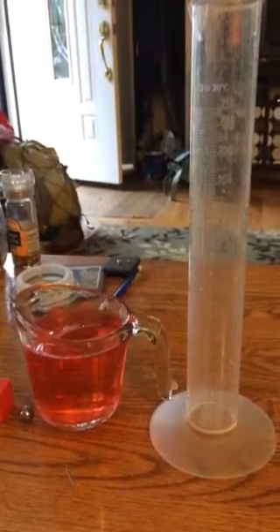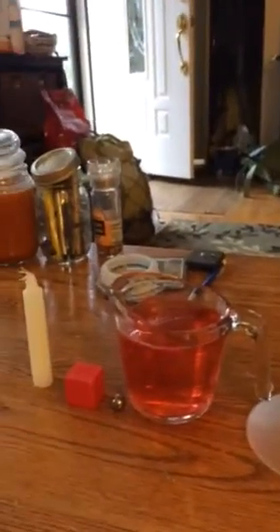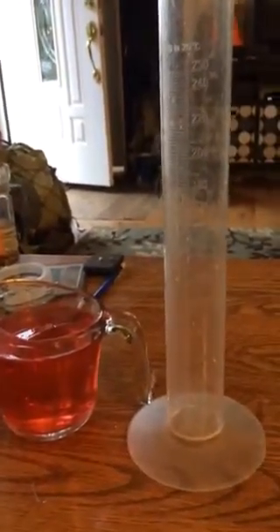Okay guys and girls, this is going to be a short video to show you how to find the volume of an irregularly shaped object by using water displacement.